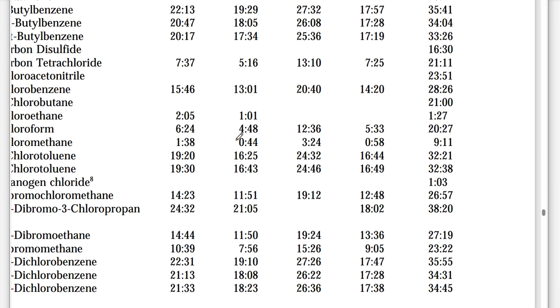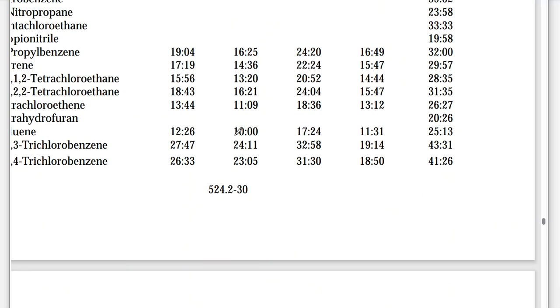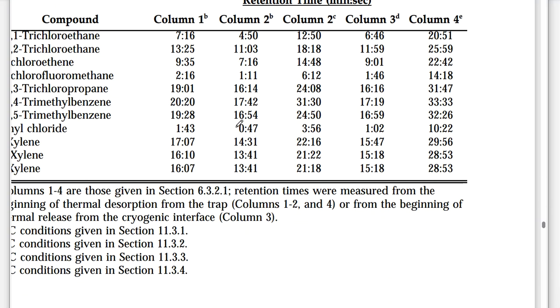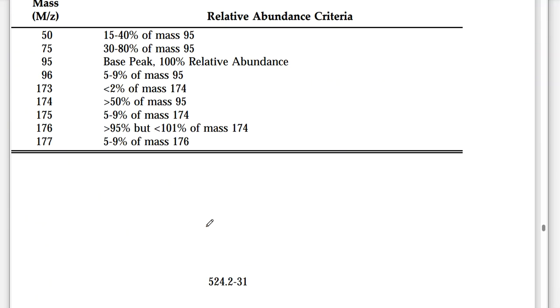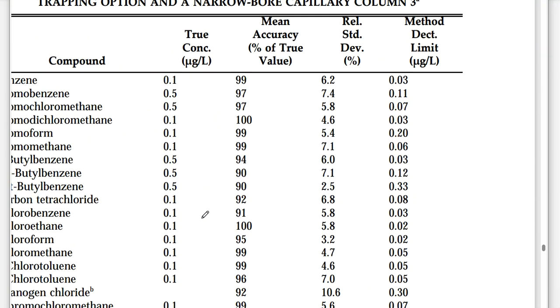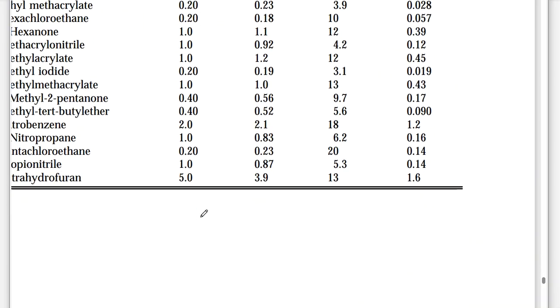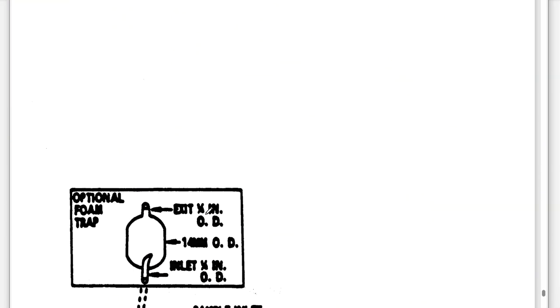As I scroll through, it is also pretty common to get report data. Like, this is what we typically see. If this is what you're looking for, this is where it comes out. This is how much will come out. This is typically the trend that's happening with these individual analytes that we are analyzing and running. It also gives me sometimes examples of chromatograms or an actual report when we start to see multiple numbers or multiple components coming through. So that's not uncommon either.